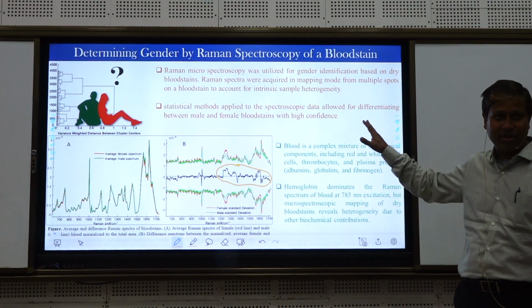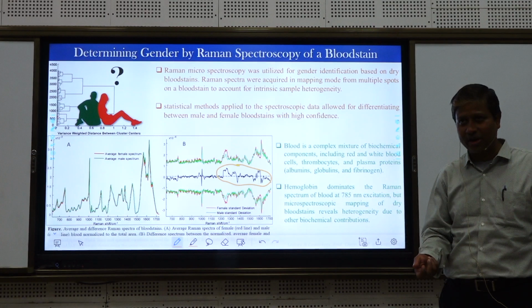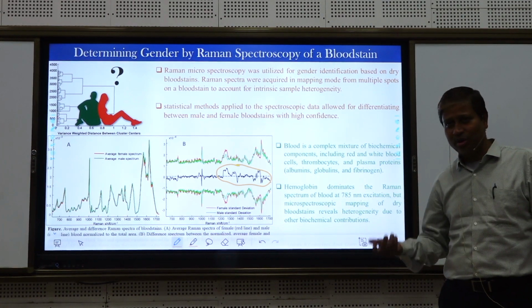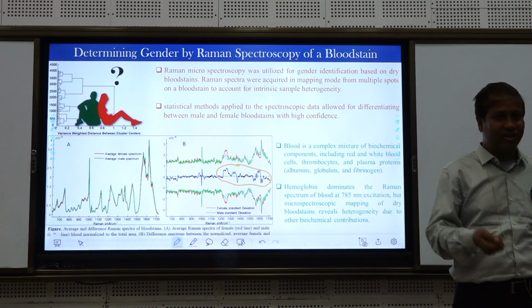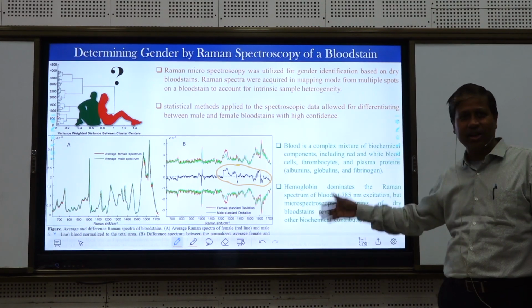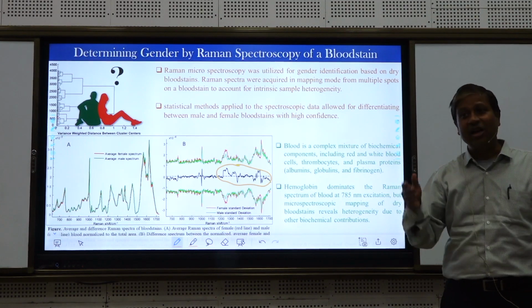These are for a crime scene. You have a blood sample or something looking like blood. You do not know whether it is human blood. If it is human blood, you do not know whether it is female or male. If it is not human blood, you do not know whether it is animal blood or even from a vegetable or something. So many types of studies are there: whether it is human blood, and if it is human blood, then whether it is male or female.